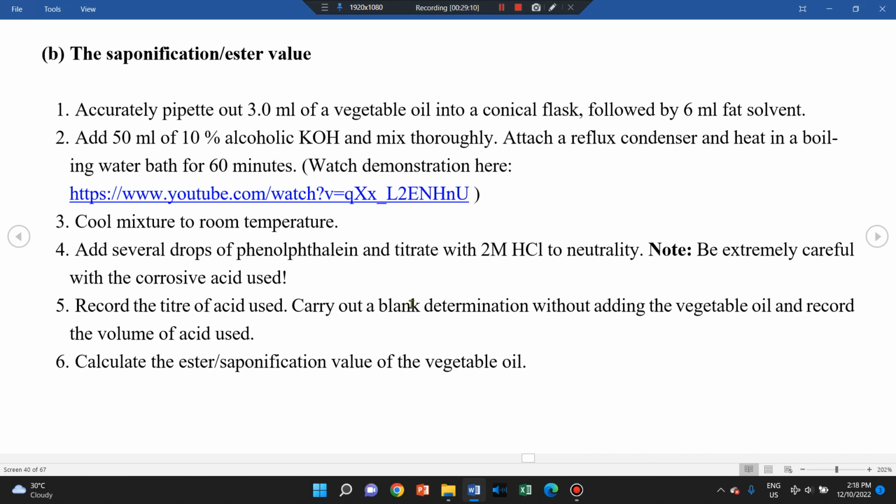Okay. So, reflux is basically heating the flask underneath, the round bottom flask, and that will cause the solution to be evaporated, and this evaporation will be touching a cold surface, the condenser, that has water running in it, and this will cause condensation. The process of evaporation and condensation will be carried on without loss to the outside environment, and this goes on for 60 minutes with the use of heat. Okay.